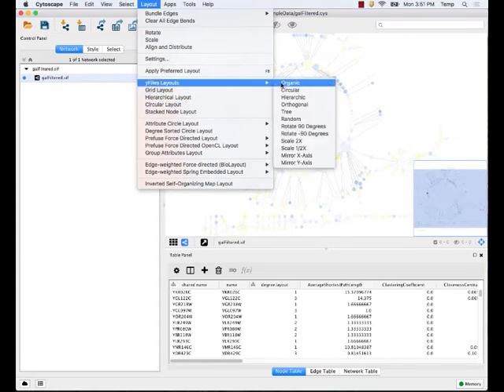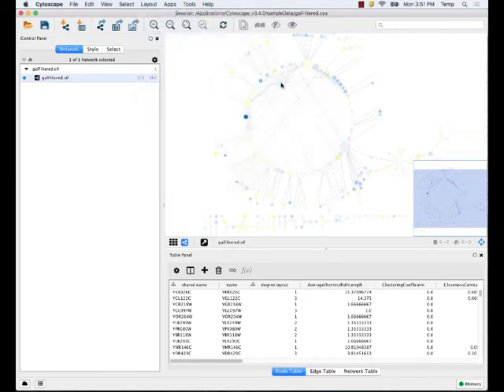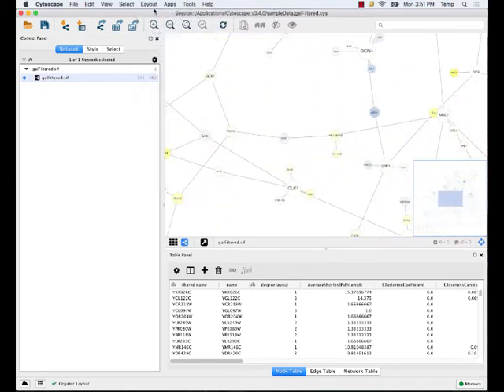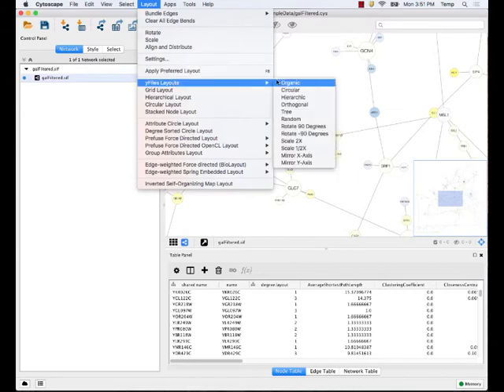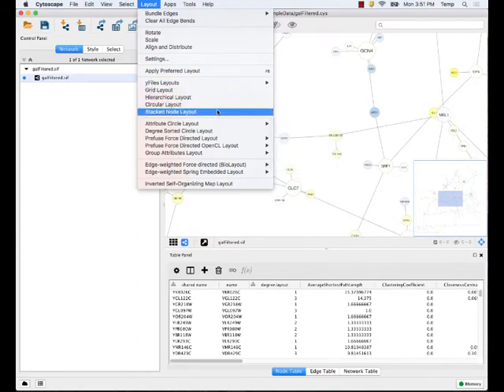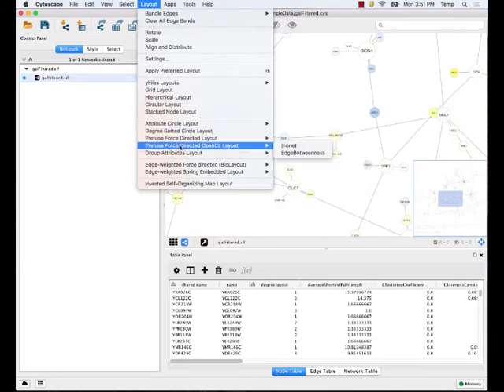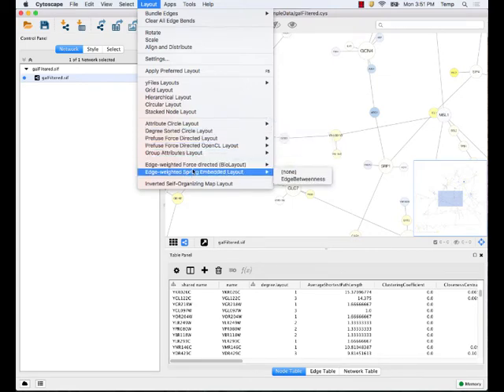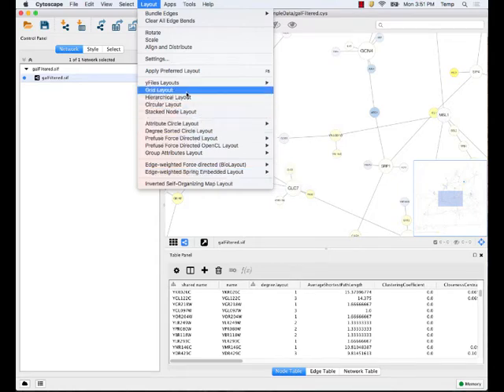Typically the layout type called force-directed — which happens to be one of the Y-files layouts like Y-files organic — is the standard one to use. Anything that says 'force directed' or 'spring embedded' is the same type of algorithm. If you have tree-like data, then a hierarchical layout is better. You can try these out and see which ones work for your network.